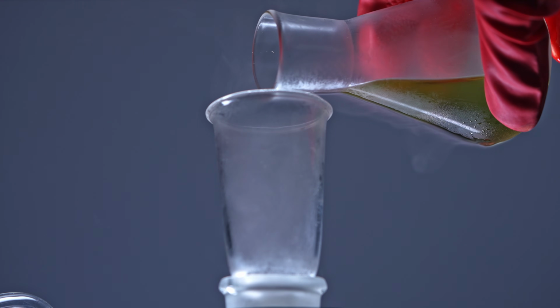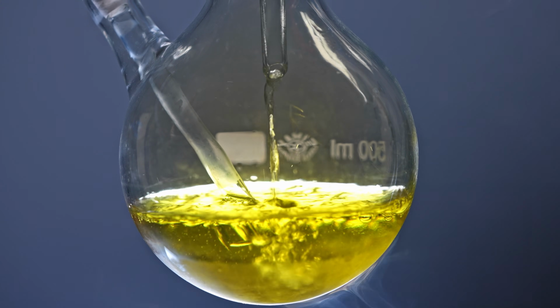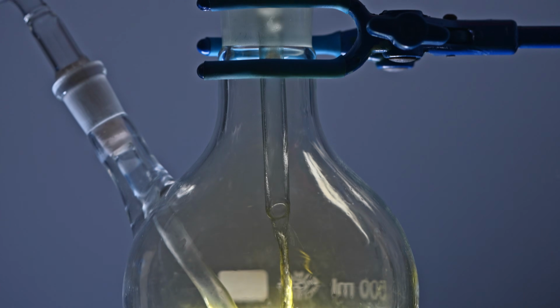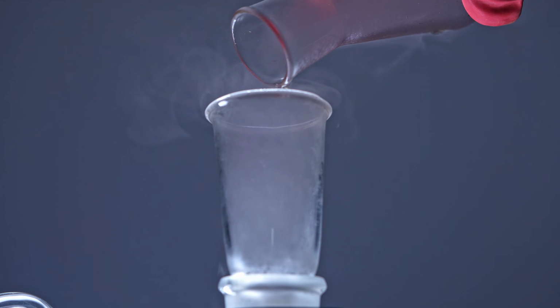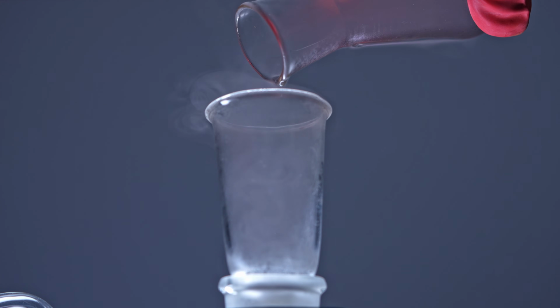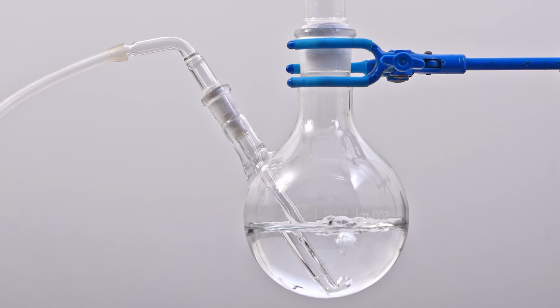But this acid won't work for producing dinitrogen pentoxide. We need colorless nitric acid, so to remove the yellow color, I'm going to pour it into a 2-neck flask and bubble ozonated oxygen through it. This takes quite a long time, but once the reaction is complete, we end up with perfectly colorless nitric acid. Bubbling ozonated oxygen through it makes the acid colorless, because part of the dissolved nitrogen dioxide gets oxidized into dinitrogen pentoxide, while the rest just desorbs out of the liquid.